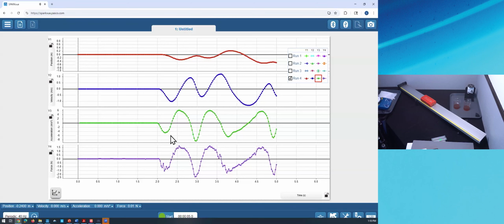Fantastic. So let's explore that a little bit more. Although I started the sensor data path here with just requesting a graph, and I let SparkView choose how to design the graph, whenever I have more questions in SparkView, I can say, you know what, give me another page. I want some more displays. And I can add a page using this new page button in the top bar.